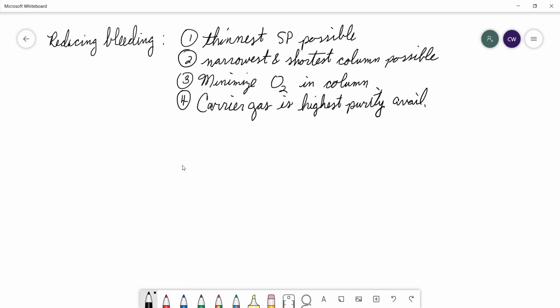Okay, folks that use hydrogen, they like to try and get as pure as possible in terms of hydrogen. And they really need to minimize the oxygen in the column because hot hydrogen gas plus oxygen gas equals boom, right?